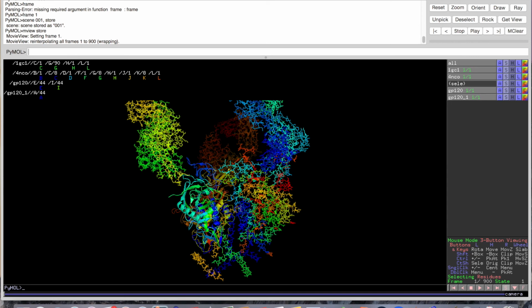I'll explain what that means in a second, but it basically blurs all your motions together and makes it a smooth transition instead of these choppy cutscenes. But we don't have any transitions yet, so we'll get to it. So let's say I want to do a 360 overview. There's a function up at the top here for 360, but I never use them because I'd like to do a more custom kind of camera display or cinematography, if you will. I mean, it's a pretty extreme word.